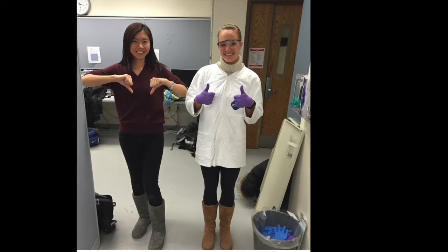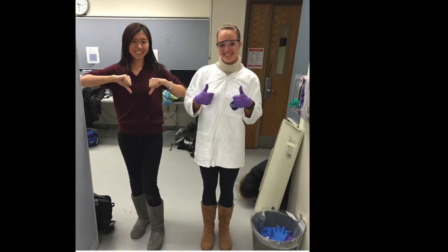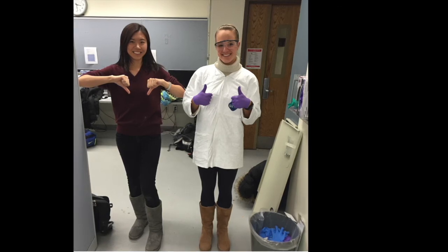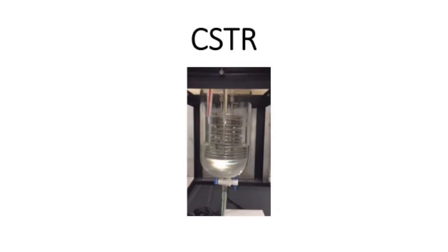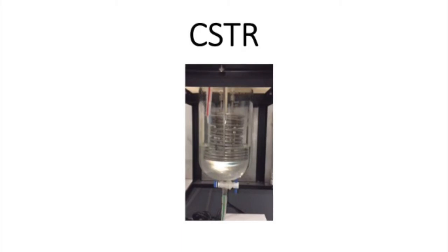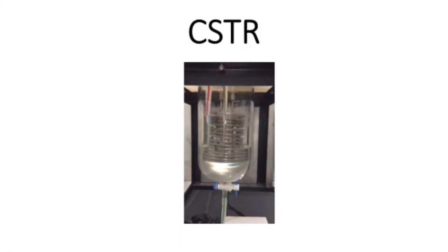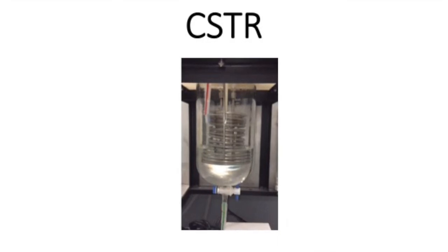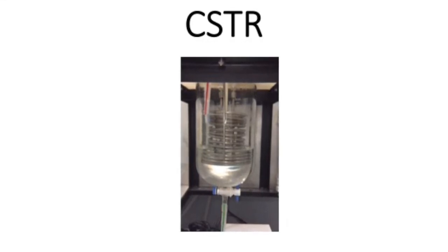If more ester is necessary, have an experienced lab technician mix additional solution in a well-ventilated area to keep the concentration of vapors below their threshold limit. The setup of the CSTR experiment involves the use of 3 pumps: caustic, ester, and outlet pumps. It is vital that the pump reservoirs be filled sufficiently above the outlet prior to turning the pumps on to avoid any air in the pumps.